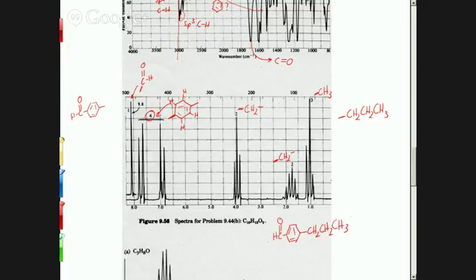That looks good, and that fits all of our splitting. There's one little problem. Anybody see it? We have a question. Yeah. Isn't there more than 10 carbons? Well, let's check that. That's always a good thing.